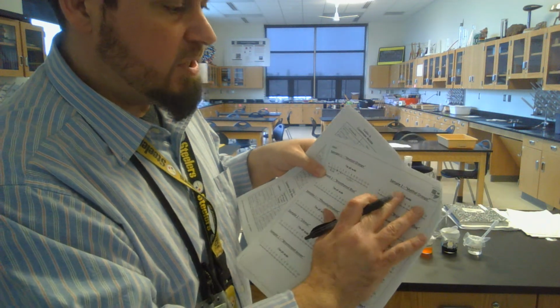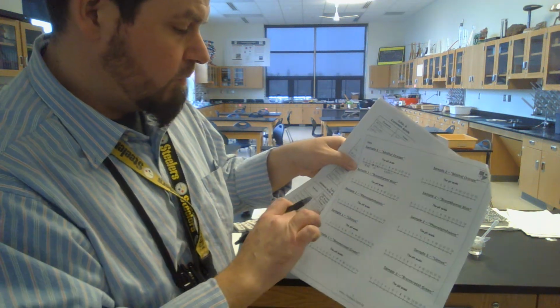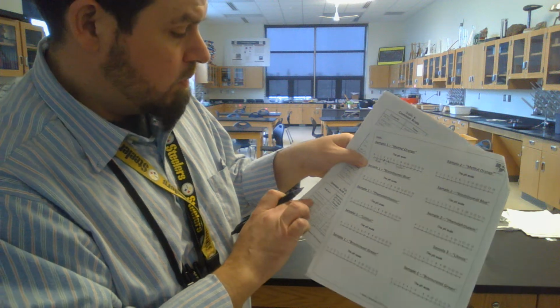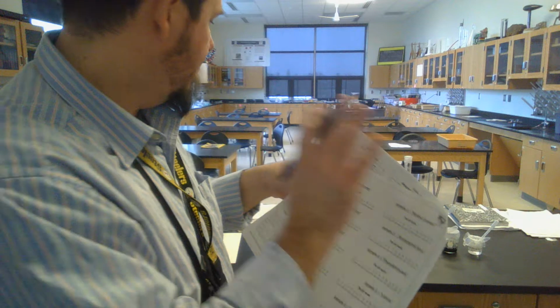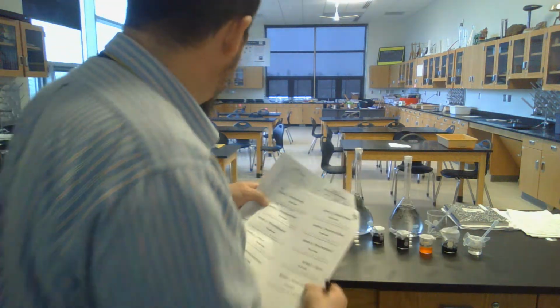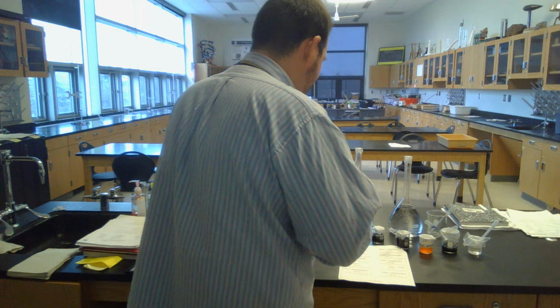Now, of course, this methyl orange will be the same, but the second one down here is bromothymol blue. So I'm going to have to put in bromothymol blue's range, mark the range, and what the colors are. Okay, and that's going to help in the long run here. So then there is what I actually want you to do.